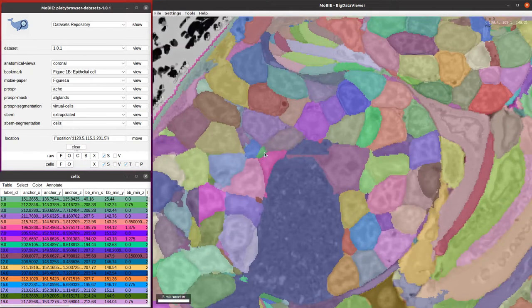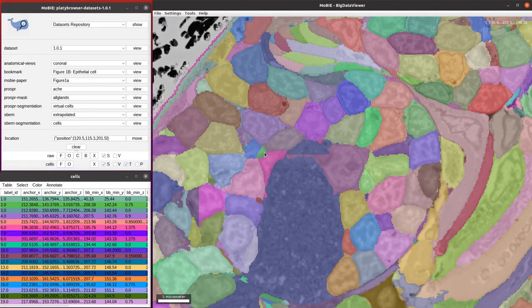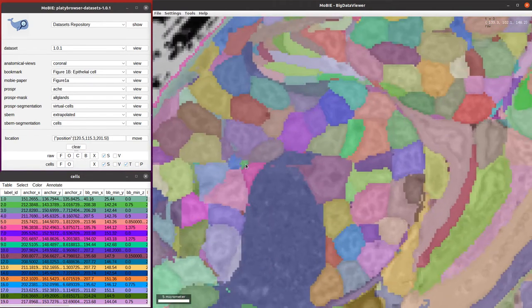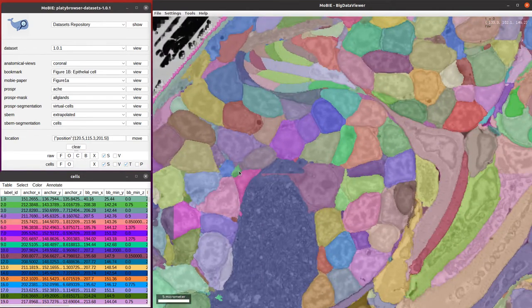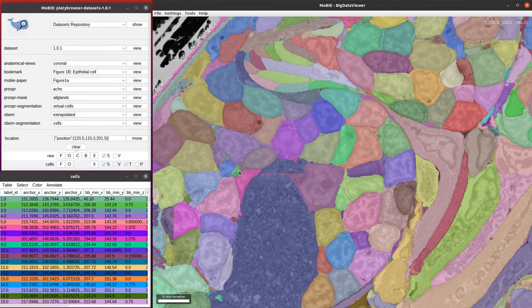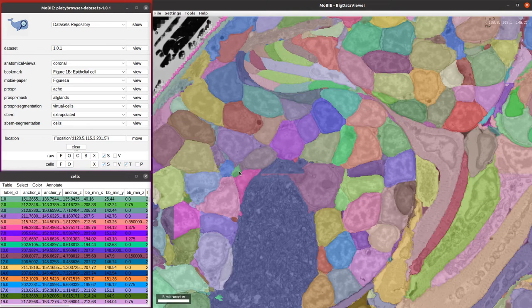Let's say that you wanted to be able to sort these individual cells into different cell types. One way you could do that is with the annotation mode that's within MoBIE. The annotation mode lets you label individual segmented objects as belonging to different categories.